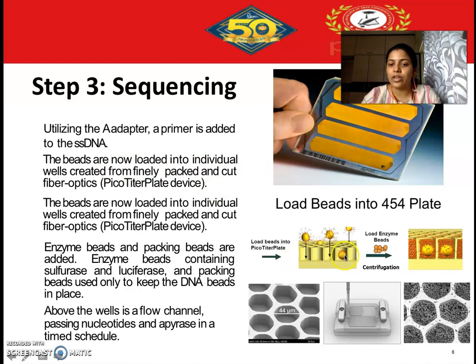So you actually have this kind of a plate. You can see this is a picotiter plate. If you look very closely, you can see such wells in it, and the wells are designed such that only one particular bead will go and occupy each well. Once these beads have occupied these wells, there are some other beads here.